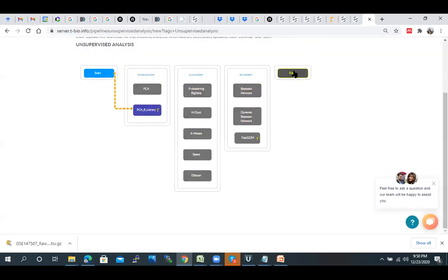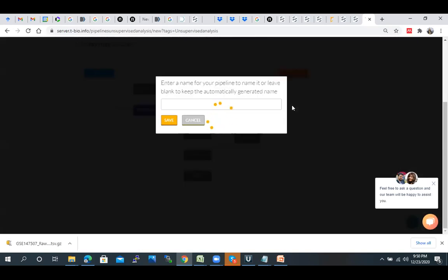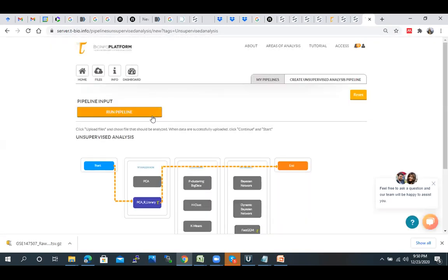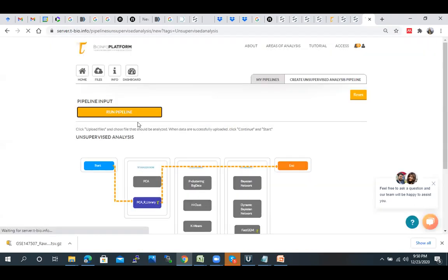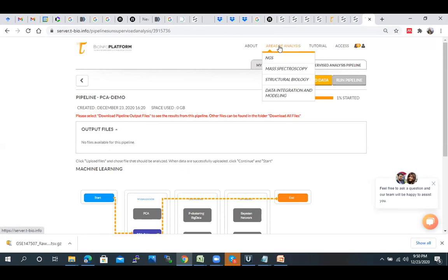And we can perform this particular analysis. It will take 1 or 2 minutes. You can perform hierarchical clustering to check the pattern. Whenever we have a gene expression table, our first approach should be to visualize the pattern within the data. That will help us understand what the different patterns are.